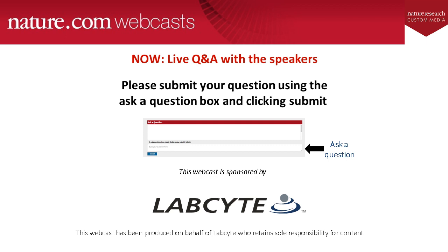Another very excellent question. Traditionally, databases have been organized taxonomically. However, the uniqueness of phylogenetic organization provides you the opportunity to achieve subspecies and strain level identification. In a taxonomic scheme, you get to the lower level of species and then directly to strain.